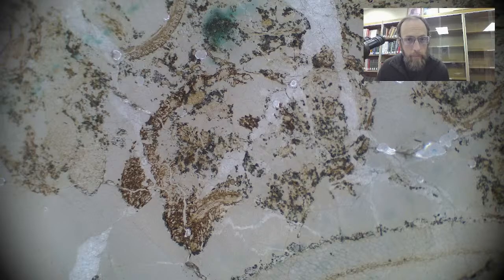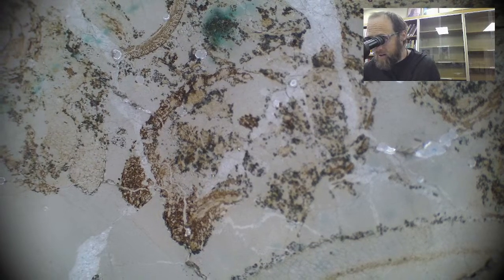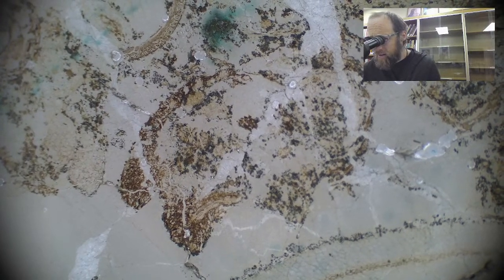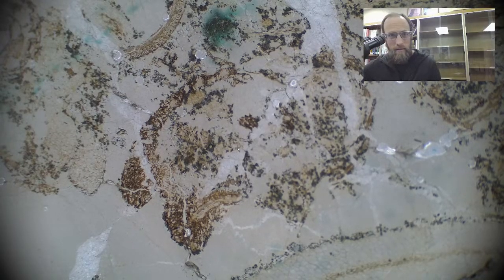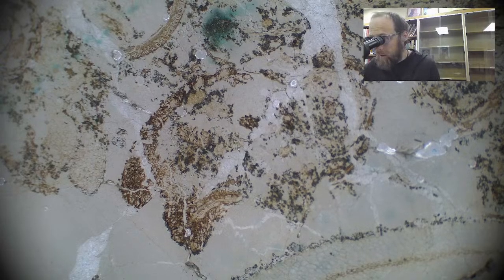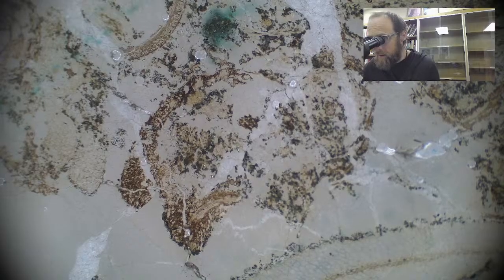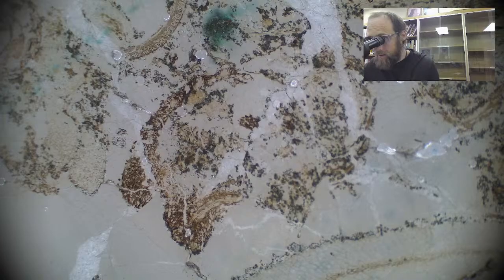And say, what's going on here? Because I definitely see certain bits that you could categorize as comminuted debris, some that I would not be able to classify necessarily, but they certainly look like plant tissues.